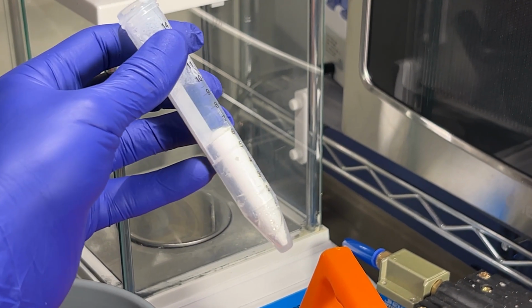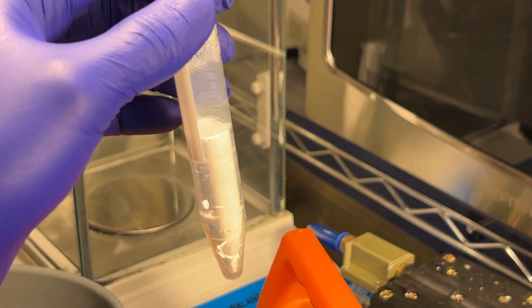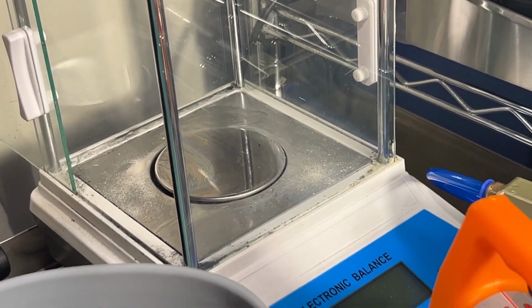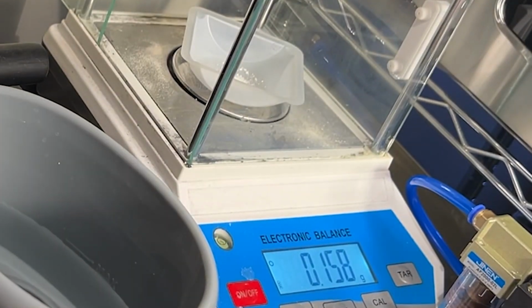Alright, so camera battery is dead, but now it's time to weigh it out. It's all dried out. I don't know if you can see it, but I'm gonna scoop it out and scrape it out into one of these wee boats back there. Weigh it on the scale to see what my yield is. Yeah! That looks about right. I got more than the paper did.